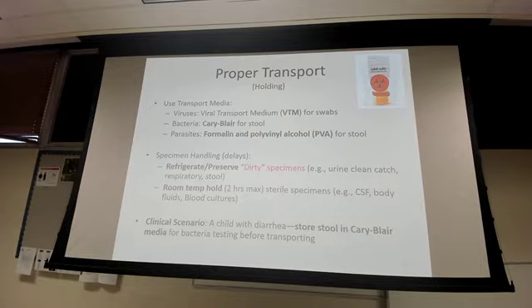In that top corner there is a biohazard bag, and it looks like there's some type of liquid sample. Please make sure that when you submit your labs, you're using these biohazard bags. Please don't submit with paper bags or Ziploc bags or wrapped up in a glove. Please don't do that, okay? Biohazard bags, please.